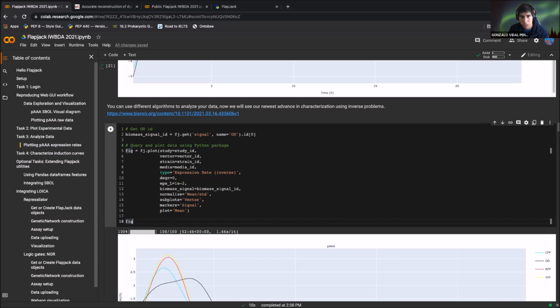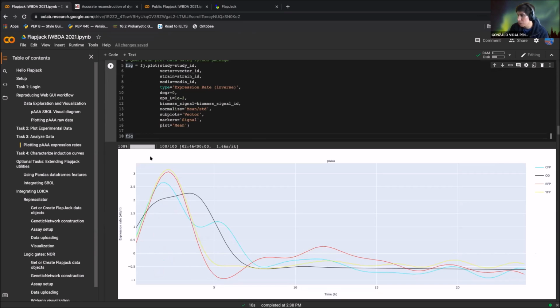So in future, the data that we will acquire will be calibrated by OD using microsphere particles or silica particles, if I remember it well. And for fluorescence, we will have MEFL. So yes, following the iGEM engineering committee standards for calibration. So far, we have calibrants for GFP, but the engineering committee is working on calibrants for RFP. So in future, we can have calibrants for that. But for example, this data cannot be calibrated now because there's no calibration for RFP, YFP, and CFP.